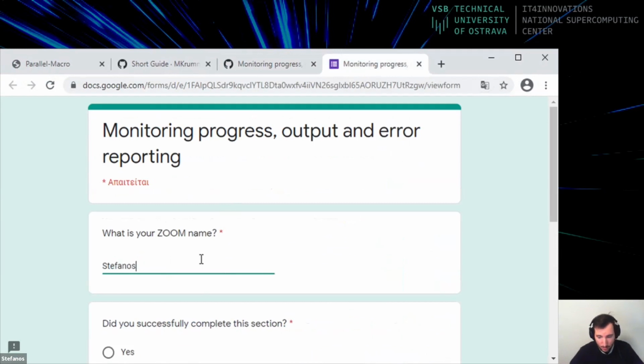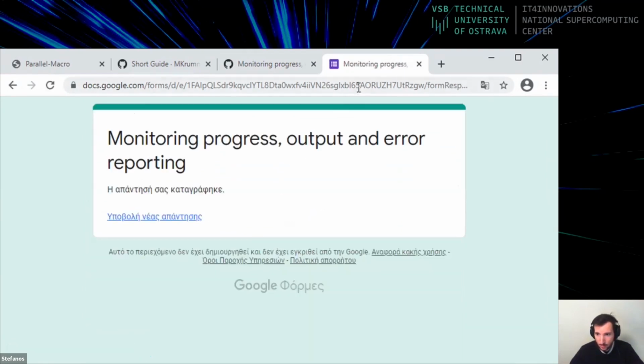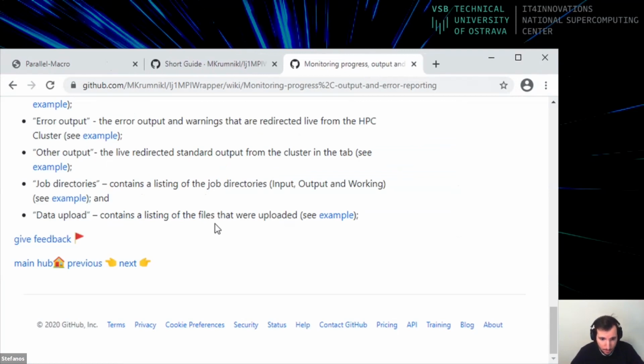So if you ran the previous job successfully, then most likely this is working. And there may be some errors in the other output tab, because we are using the same shared Fiji, and there might be some file lock related errors. There is a fix for that, but usually we would each have an installation of the remote Fiji in our home folder, so this would not be an issue there. So Michal, is everyone okay?